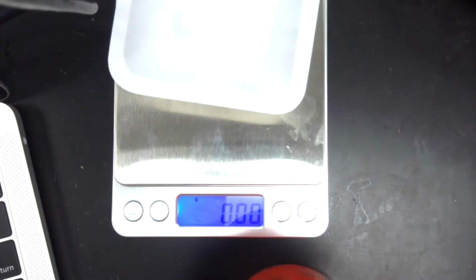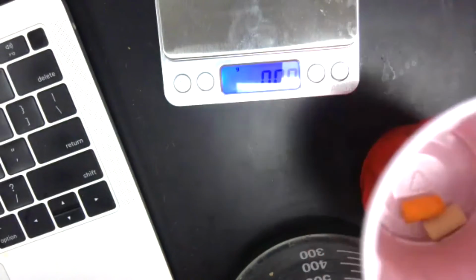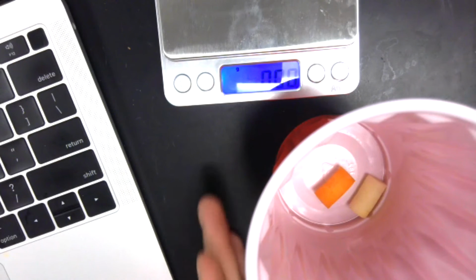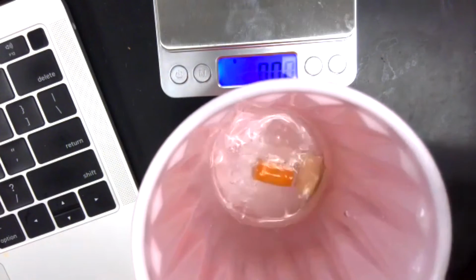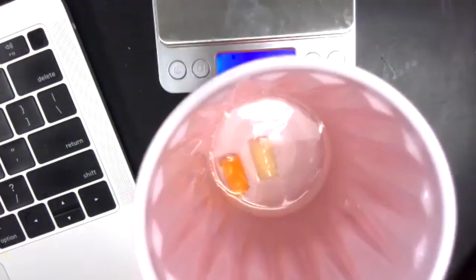So I'm going to take my flask, and put just enough to cover. Let me see here. Yeah, I think that's good.